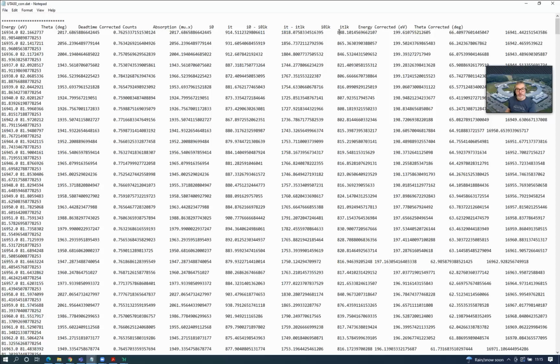And your IT minus IT leakage data. So your IT corrected for leakage, again, merged IT, subtracted from which is the polynomial modeled IT leakage data. Okay, so just to summarize again, in Athena, your energy column would be energy values corrected, of course, and then I0 would be I0 minus I0 leakage, and IT would be IT minus IT leakage.